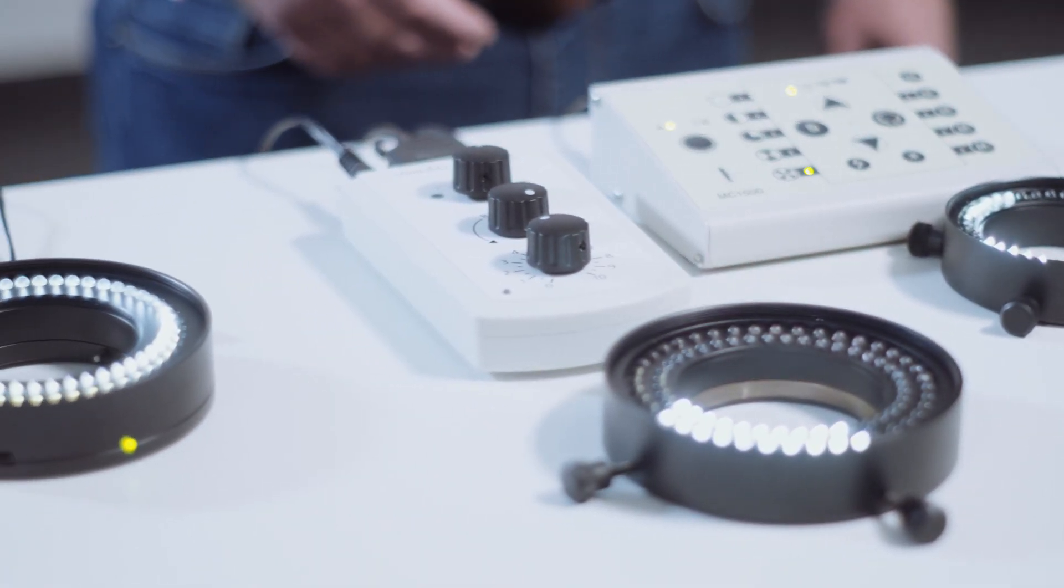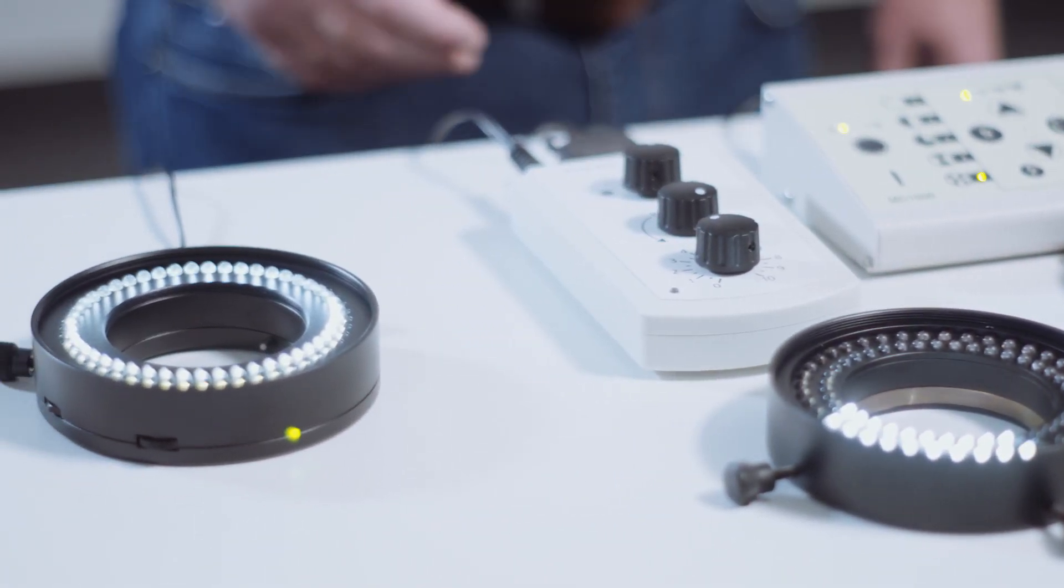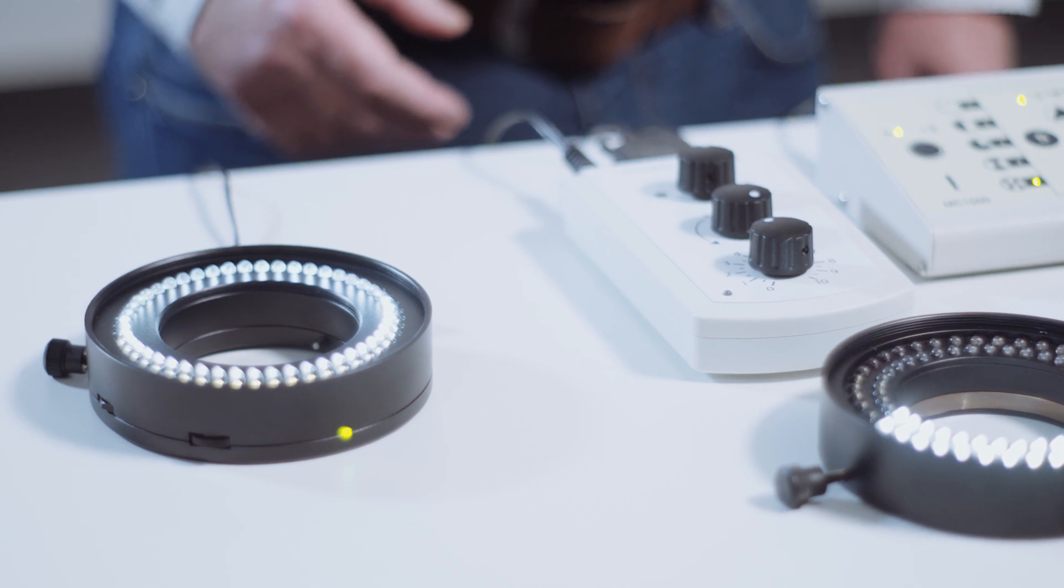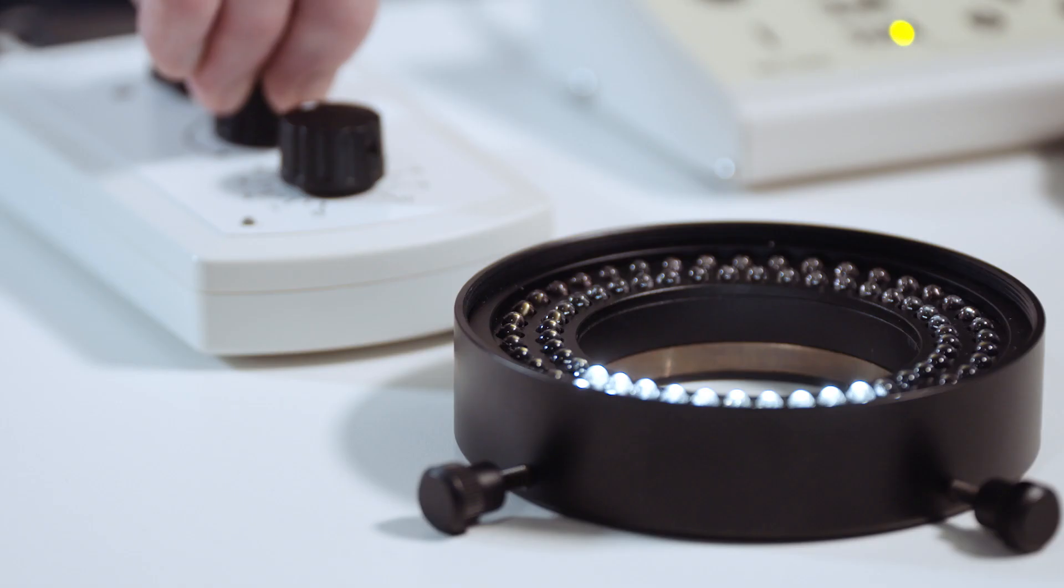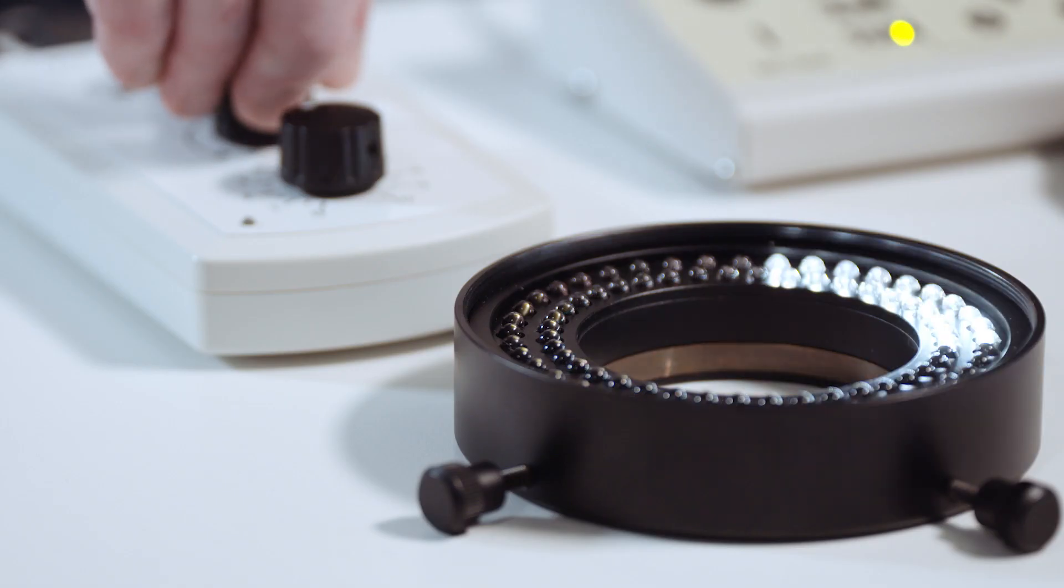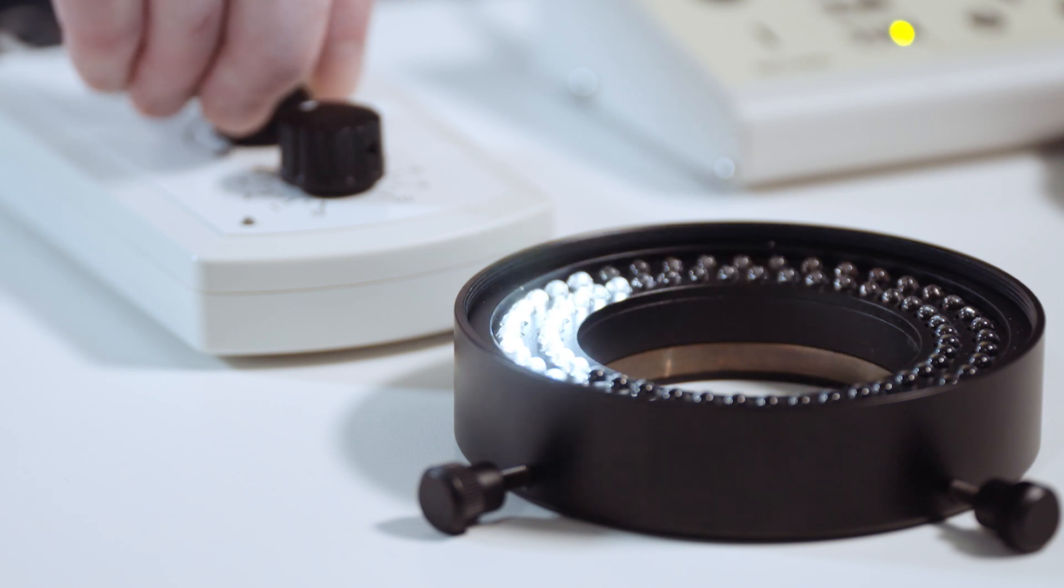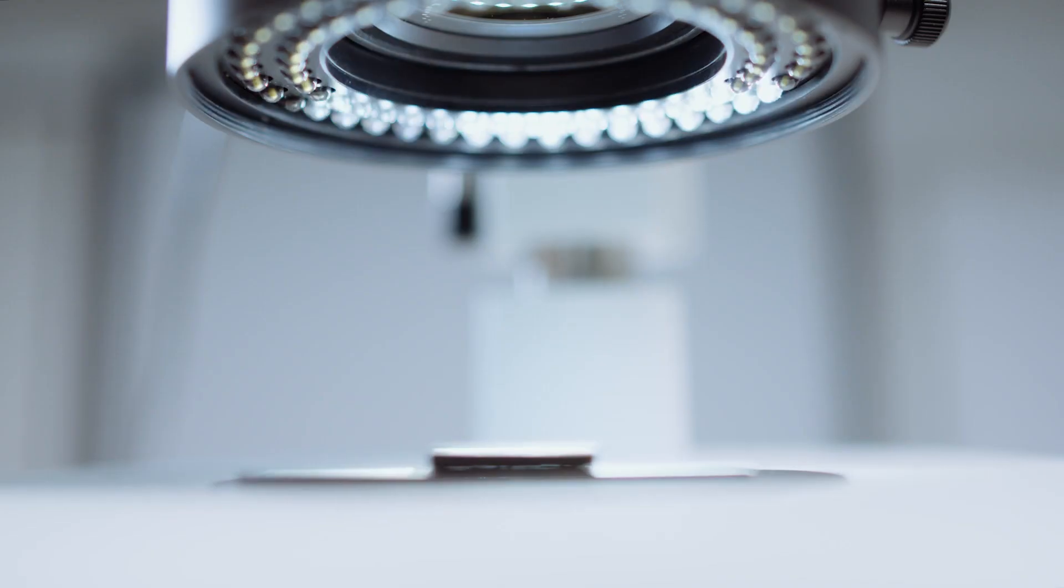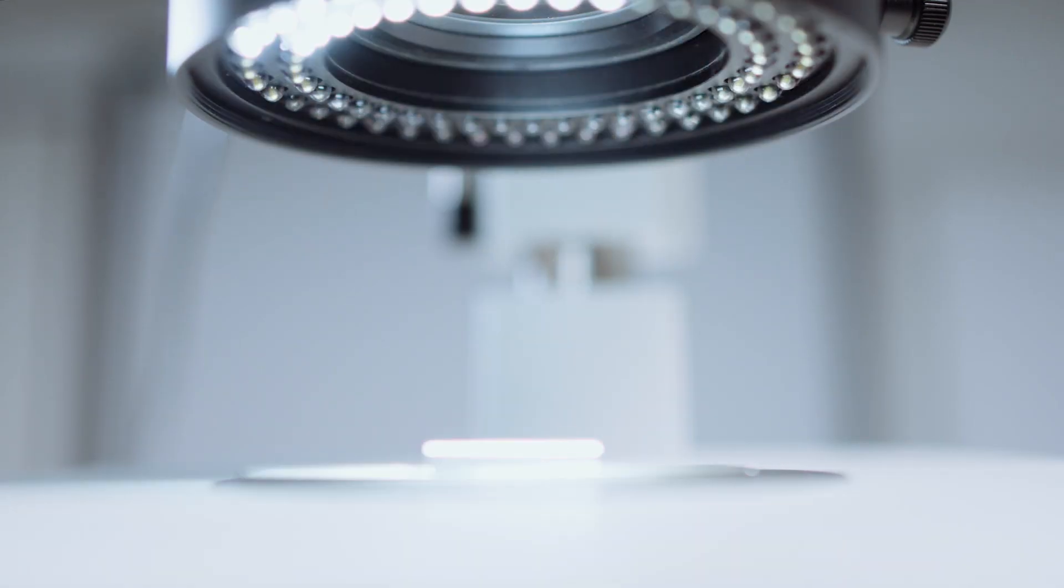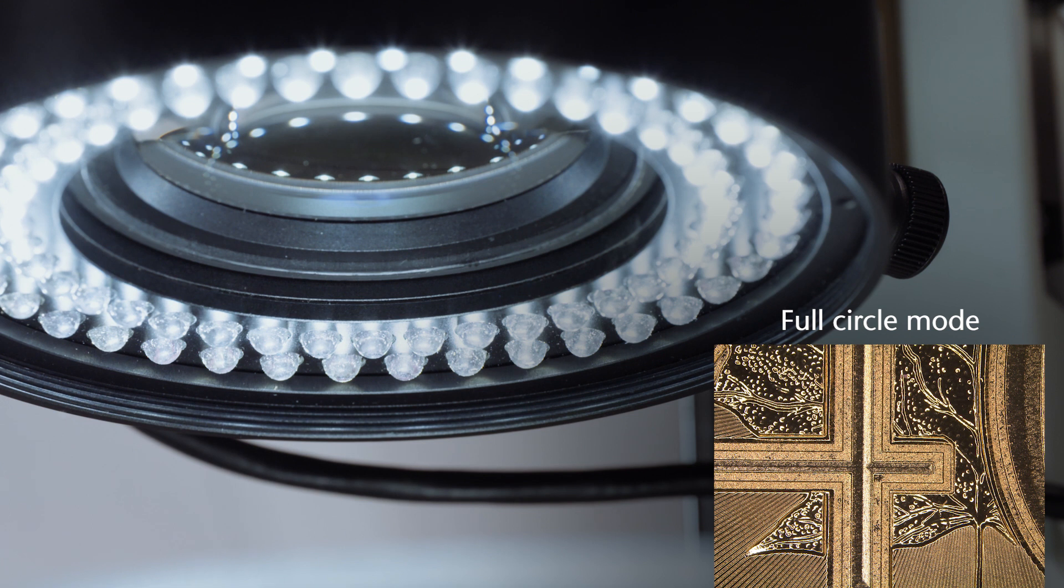Both ring lights from our VZLED and EZLED series enable segmentation. Generally speaking, segmentation allows for only parts of the ring light to be illuminated and rotated around the sample. This allows surface structures to be highlighted and avoids reflections.